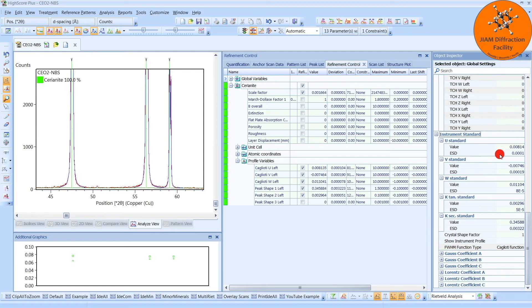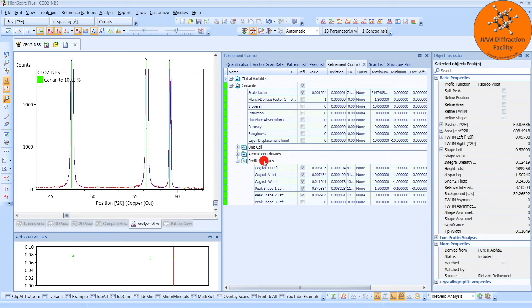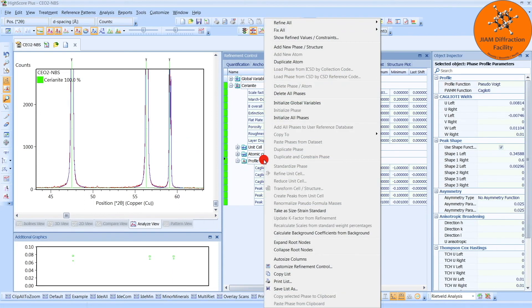But if you tend to use a lot of different optics for your samples, then I wouldn't make these default. I won't make these default in this situation because this data file here, the standard data file, does not apply to my diffractometer since it was collected at Panalytical. So just for this example, I will save it by choosing take as size strain standard.